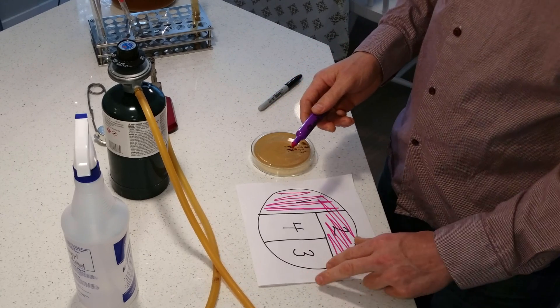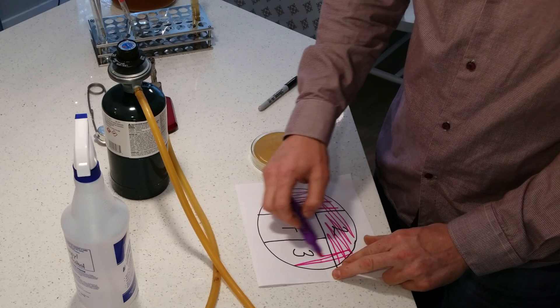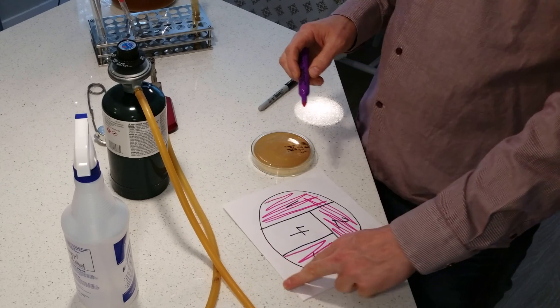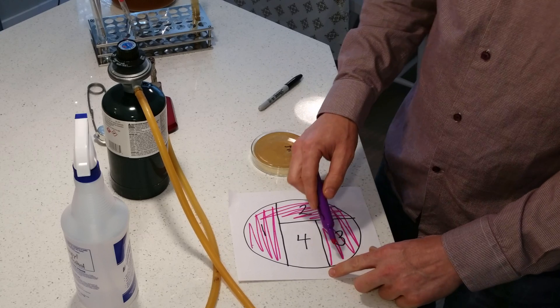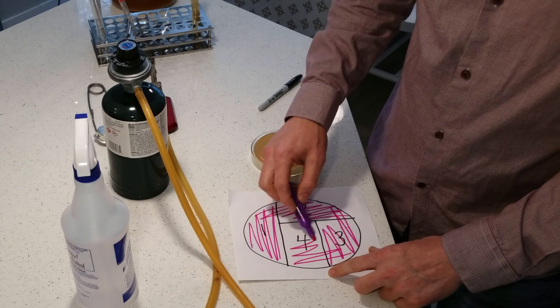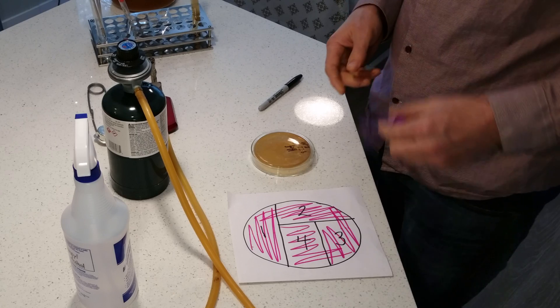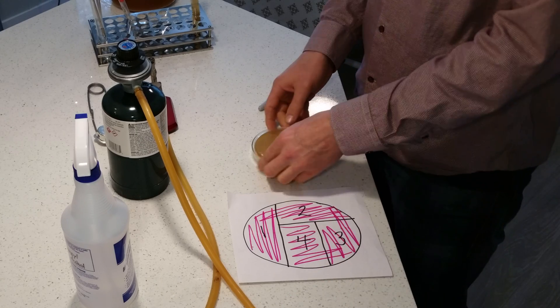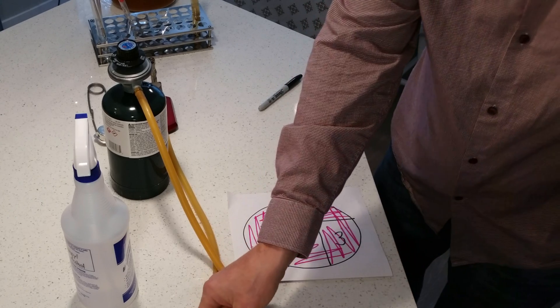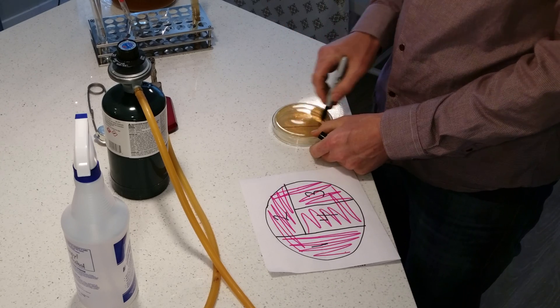Then we'll re-burn the loop, turn the plate 90 degrees again, and do the same thing — streak through at least twice from the old yeast. What we're doing is gradually thinning out the cells so hopefully we'll end up with individual cells. Then we'll rotate one last time, go through twice, and streak the final quadrant. I can mark this pattern on the back of a different plate so you can see what we're doing, though you normally don't mark it.